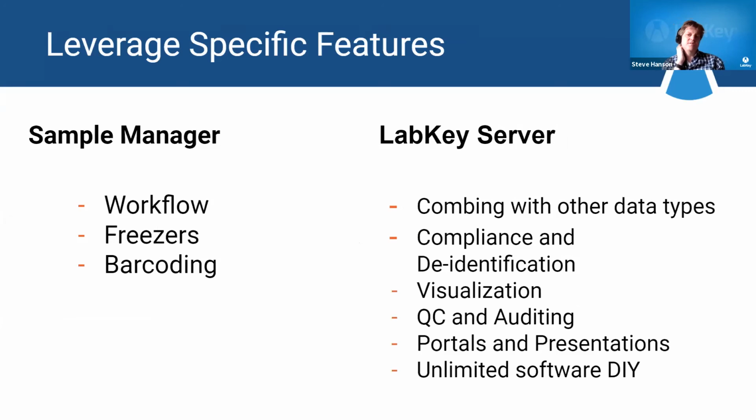Also, Sample Manager, although it's ultimately based in LabKey Server, there are specific features that each tool surfaces that can't be found in the other. For Sample Manager, I'm thinking of workflow, the jobs workflow that Hannah was showing earlier. The freezer management system, something that's only surfaced in Sample Manager. And also the barcoding that's just around the corner.